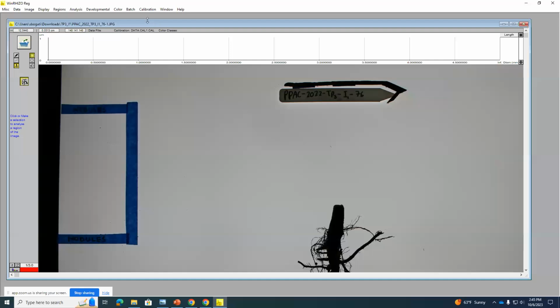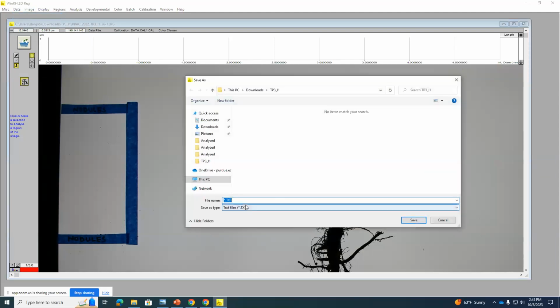My next step is to open the file, and open the file meaning where I want to save my data. So I'm going to open a new file, and I'm going to write it as a 144. I think it was time point.